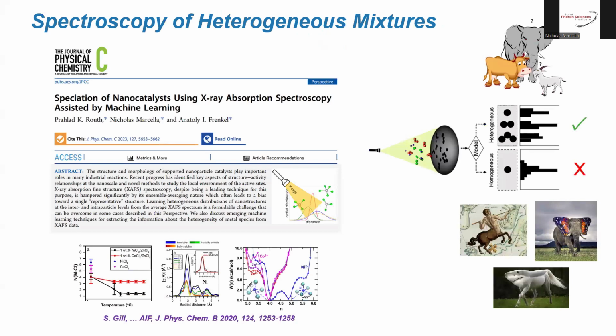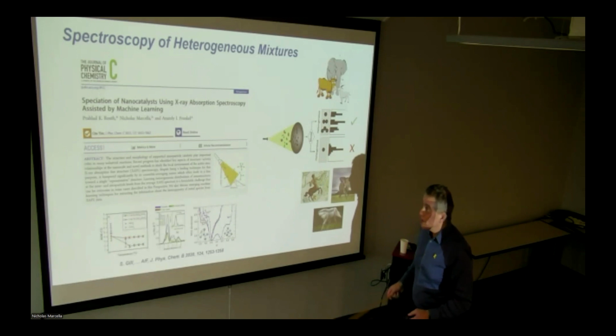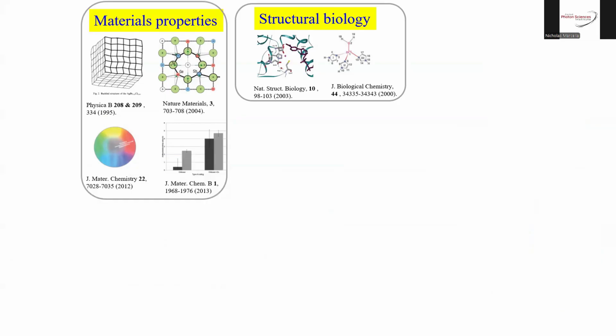And you have Nick here, who is an expert in XAFS, and you can always go to him and Karina and others, all here. There are so many good things that you can learn about it and even contribute. In fact, we're learning ourselves in our group how to understand different complicated things, and we develop new methods such as machine learning for answering this. This is the article that Nick co-led, where he summarized the methods. It's a review, a perspective on how to speciate those heterogeneous nanomaterials using XAFS, including machine learning methods. So that's just one example.